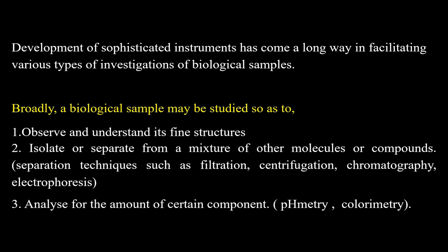Development of sophisticated instruments has come a long way in facilitating various types of investigations of biological samples. Broadly, a biological sample can be studied so as to observe and understand its fine structure. Secondly, to isolate or separate it from a mixture of other molecules or compounds.